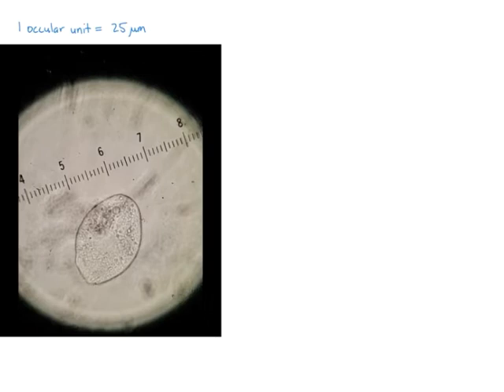Ideally you want to align the axis of the organism with the ruler, but since this is an image we're just going to approximate. Let's say this distance right here is equal to 2.1 ocular units.